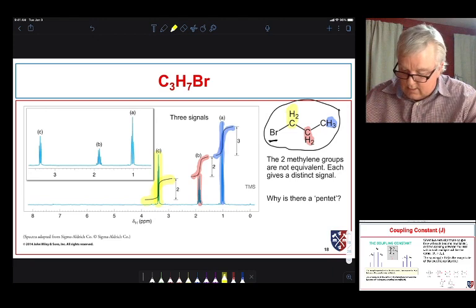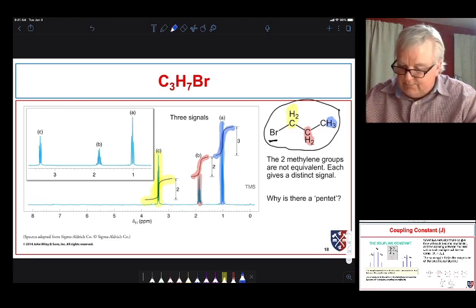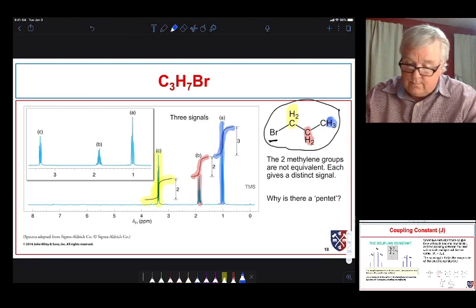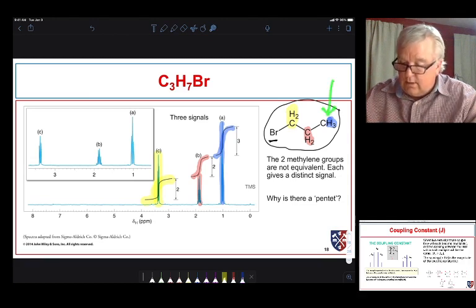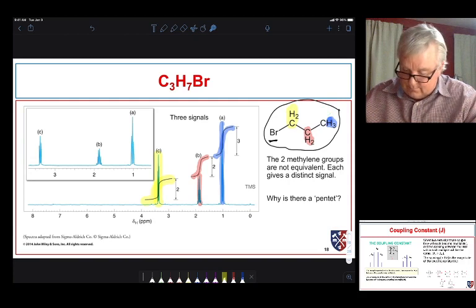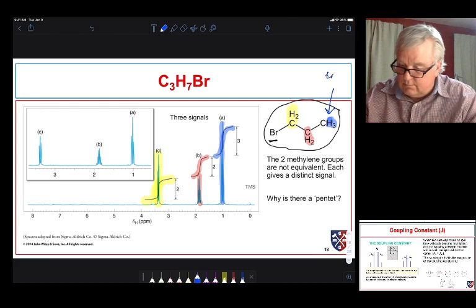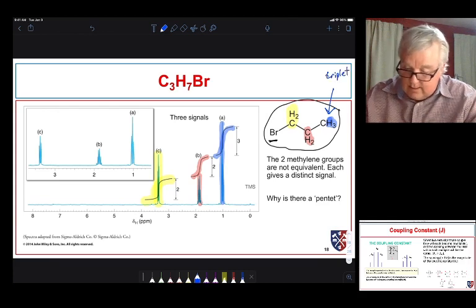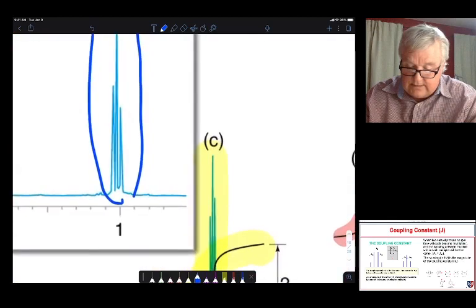Let's take a look at the splitting then. So our peak that's furthest upfield, right here, there's a CH3 group next to a CH2 group. We expect to see a triplet. That integrates for 3. This integrates for 3. Here it is here. And it is a nice triplet. Let's expand it and we see it's a triplet.